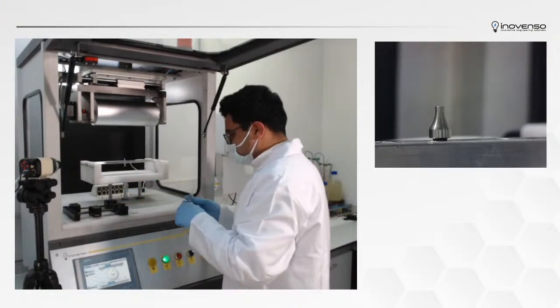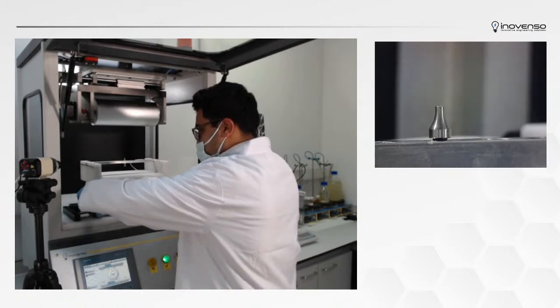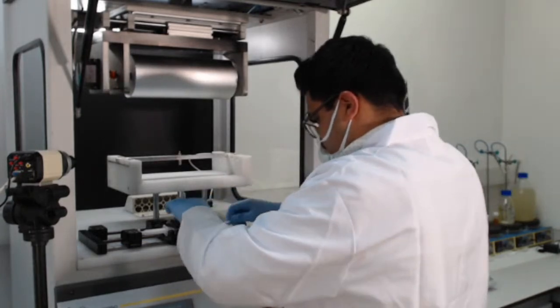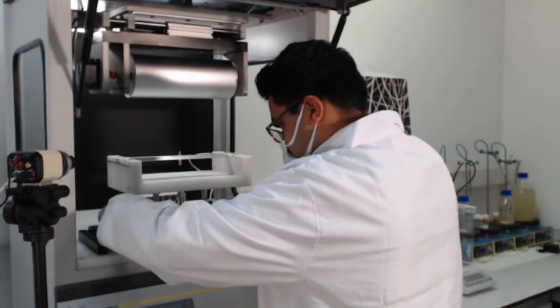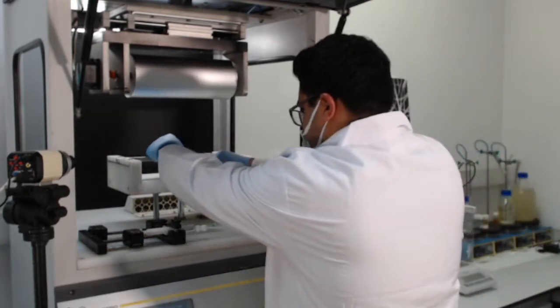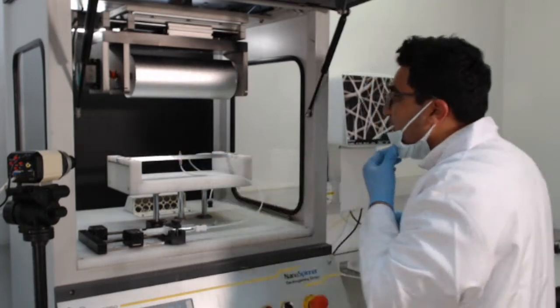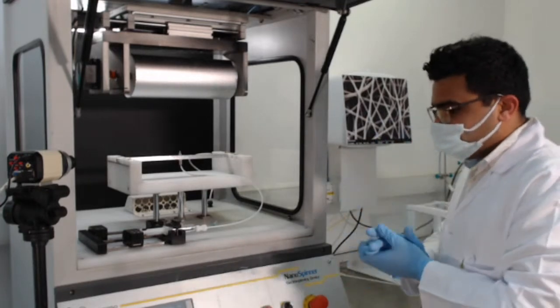1 second. I'm going to place it into the syringe pump system, so that it can feed the solution into the system at a particular rate. Okay, it's going to be attached up here. Essentially, what I've done is I've made a channel for the syringe pump all the way to the nozzle. Okay, I think we're set. We're ready to start our electrospinning experiment.